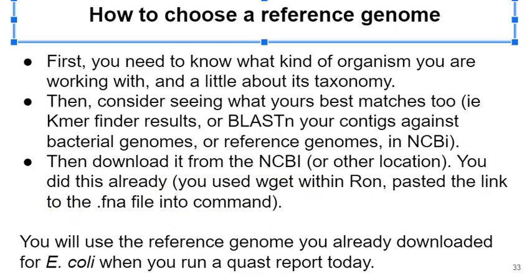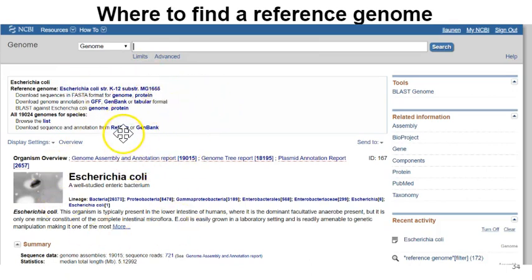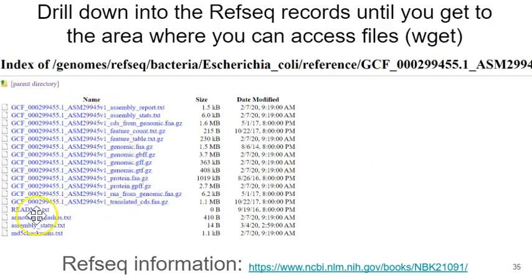There are a variety of databases that host reference genomes. Here I'm going to mention the area on NCBI called RefSeq. The font's really small, but RefSeq is shown here as an option. I just went into the genome area of NCBI and typed in E. coli, hit enter, and got this page. If I keep drilling down into the RefSeq area, I will get into the area containing the FTP-hosted information on a reference assembly for E. coli, and I can use the wget command to pull any of that into a server like RON. If you want to know more about the RefSeq database, you can take a look at it in the NCBI handbook at the link there.